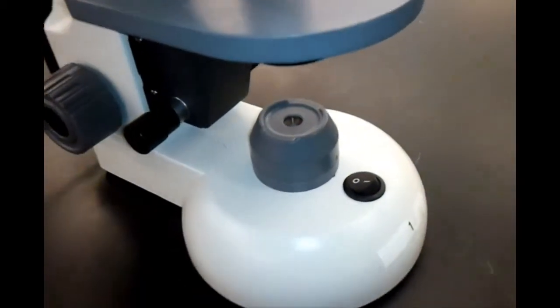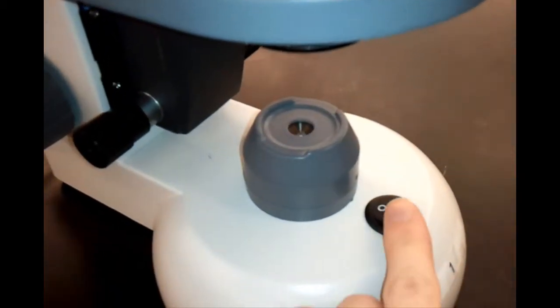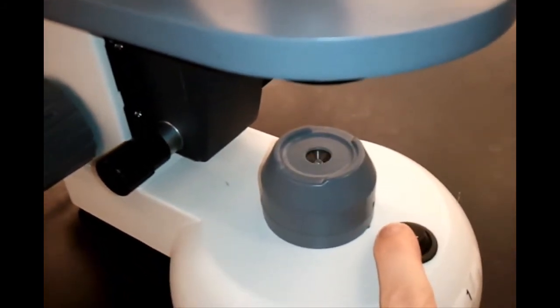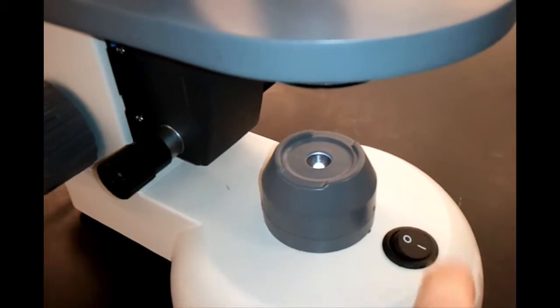In order to see an image through the microscope, a light source is needed. Some microscopes use a mirror to collect light, but this microscope has a light box that can be turned on and off.